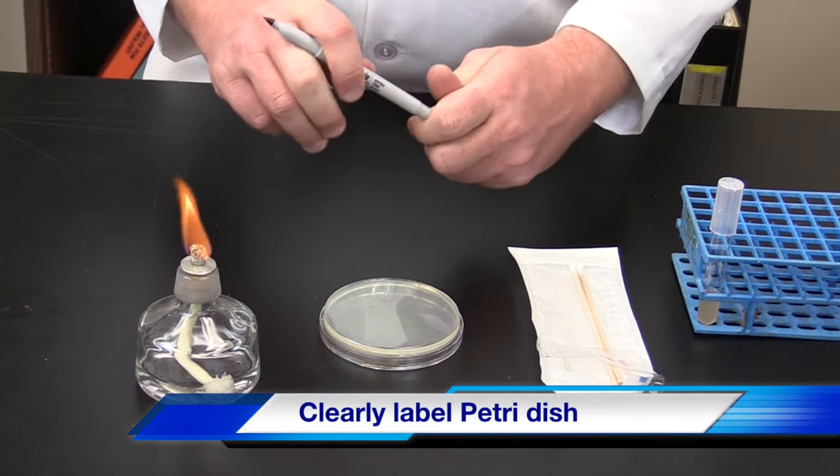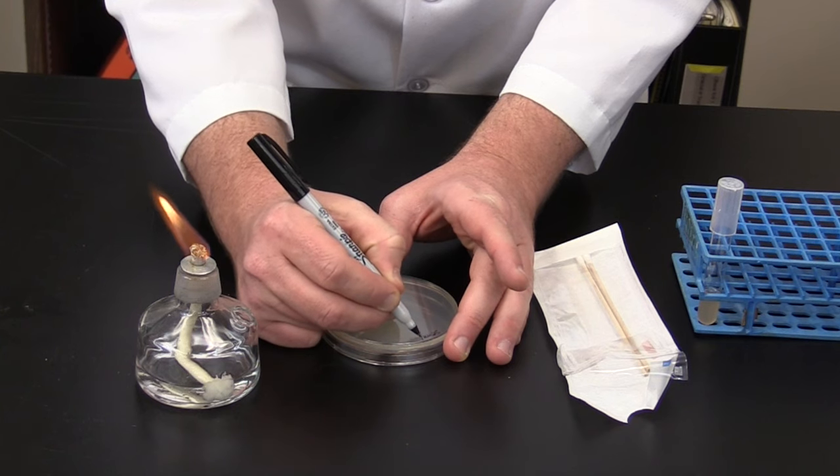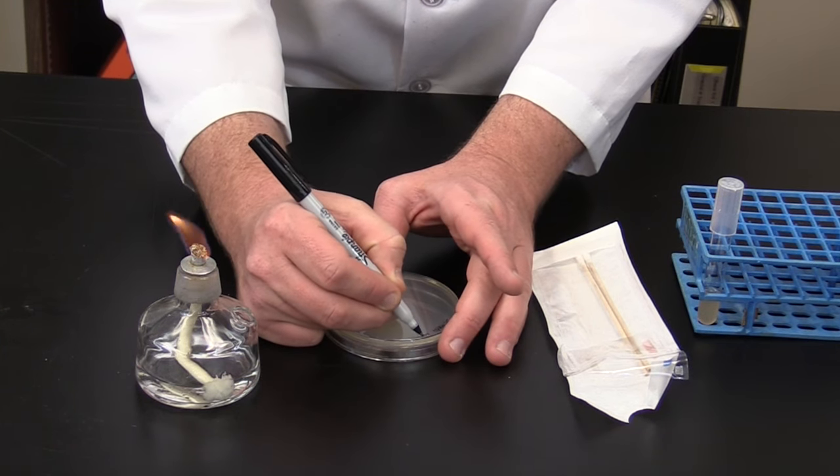To begin, label the outside rim of the petri dish on the agar side and label with the organism name, lab section information, and treatment.